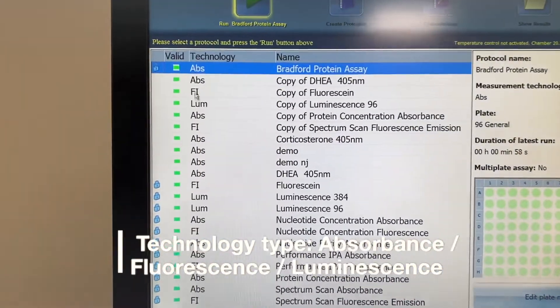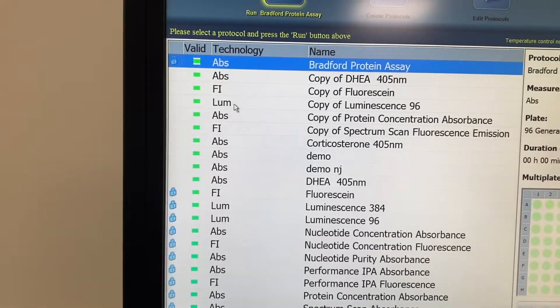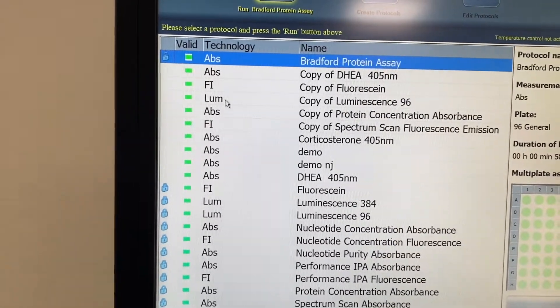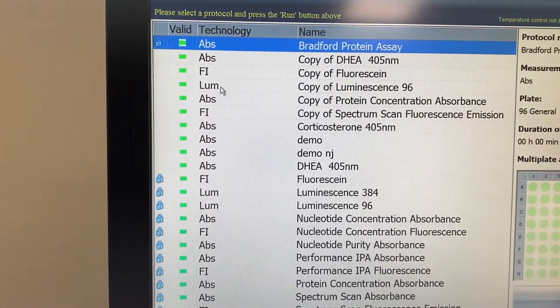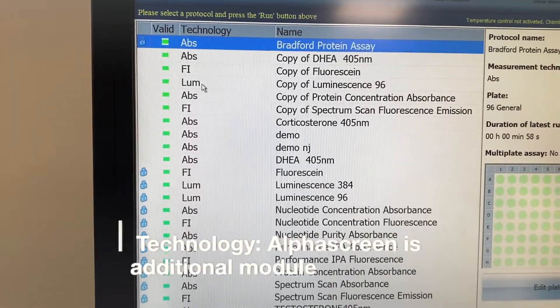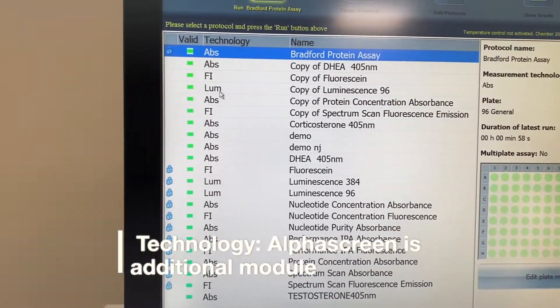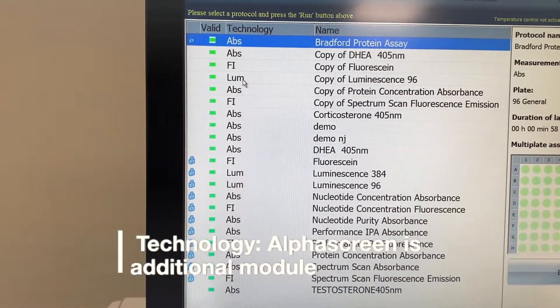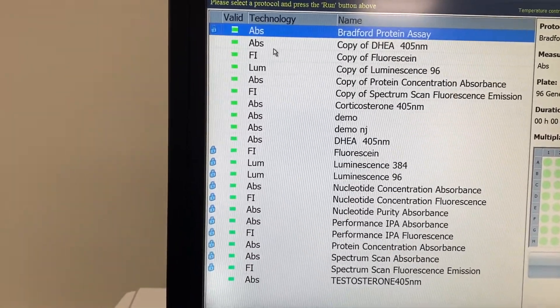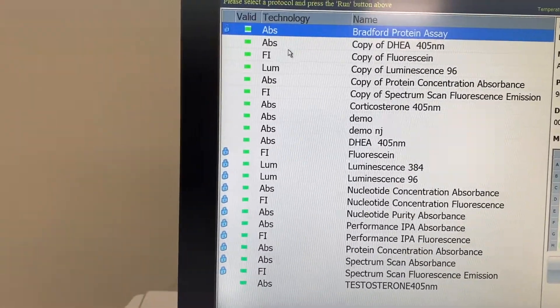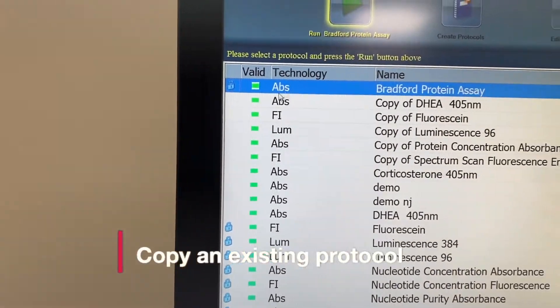You can do an absorbance read, a fluorescent read, or a luminescent read. On some models you can also do AlphaScreen reads, but those require specific detectors that you would have to add on to the instrument. The Envision as given to you doesn't have it.